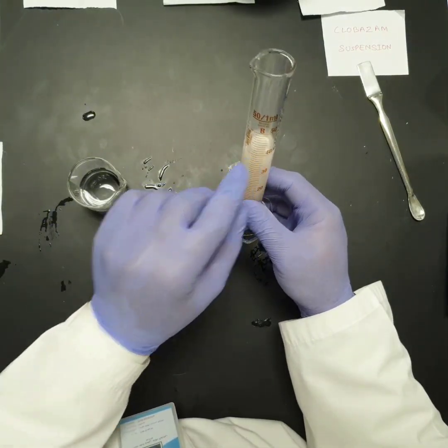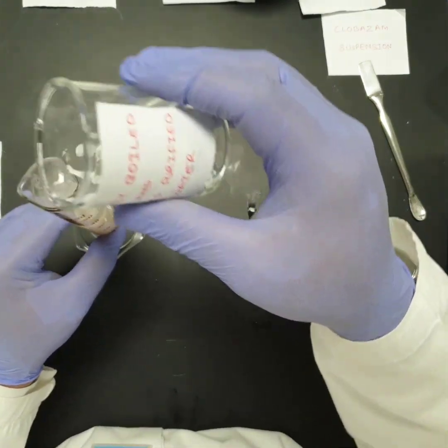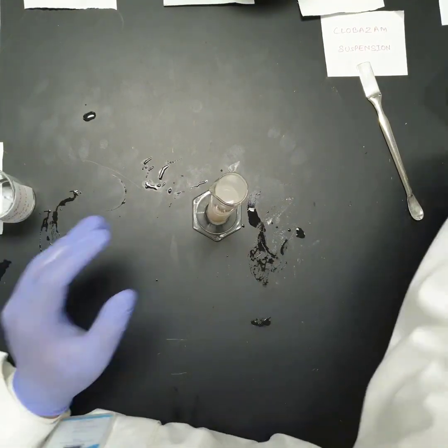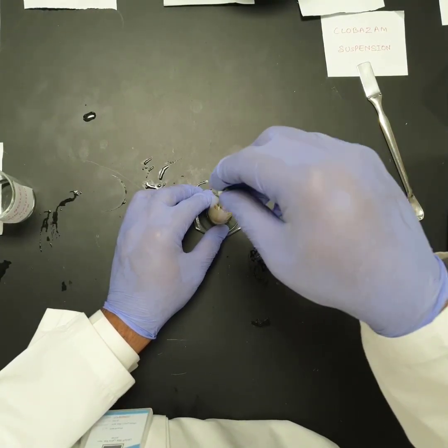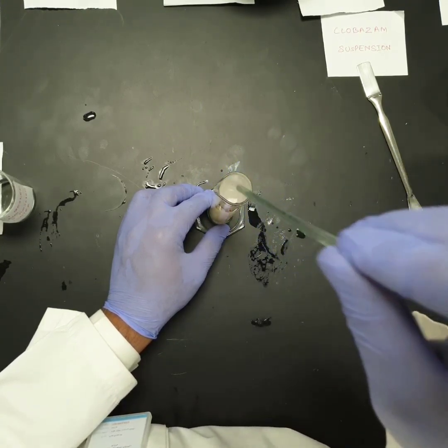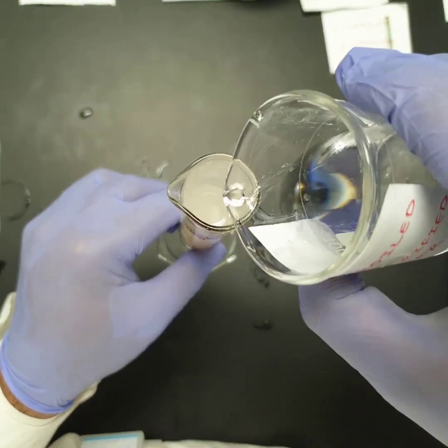Now this cylinder has almost 40 ml, so I am going to adjust the final volume with freshly boiled and cooled purified water directly. I am going to keep this graduated cylinder at my eye level and adjust it. Yeah, this is now a little bit less than 50 ml and I am going to mix this with the help of a glass rod so that all the powders, glycerol, syrup, the flavoring agent, and the final vehicle will be mixed properly. So after it is mixed with the glass rod, I am going to adjust the final volume to 50 ml.